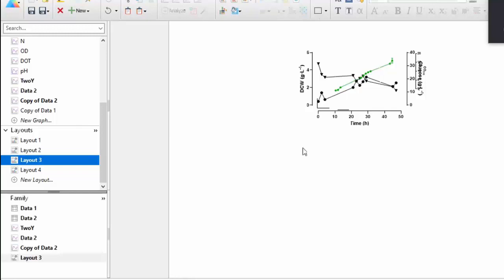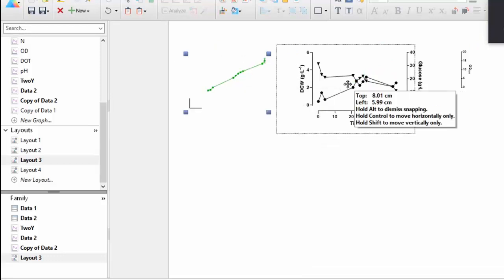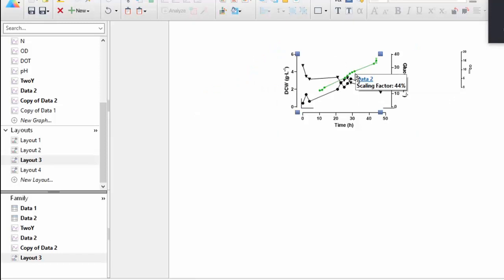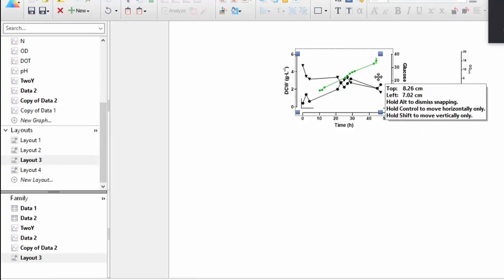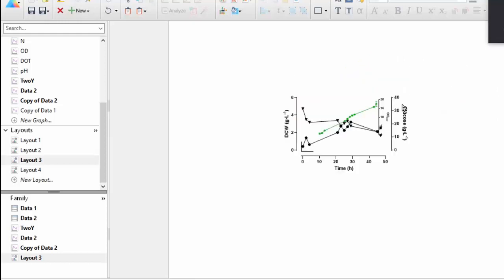So it is 3. You can see all of them are multiple graphs. You've got 3, and then you can overlay them after you equalize with x-axis aligned, and then you get a graph that will be something like running. So I didn't look into the axes. Yes. Anyway, so that's how you do it for multiple.